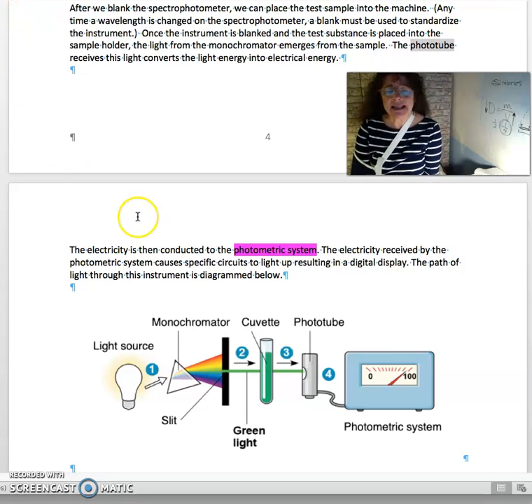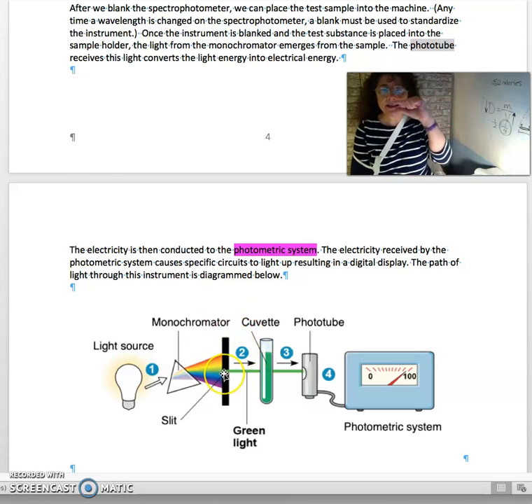So in this case, at number 2, we are sending in only wavelengths of green light through to this sample. This slit is really ratcheted down to just let those wavelengths through. That doesn't need to be the case. The slit can be quite wide. The slit can cover anywhere from ultraviolet all the way up to the red. And in most cases, when you're starting on a study, you go wide and then you gradually narrow it down. We'll explore a little bit more about that.